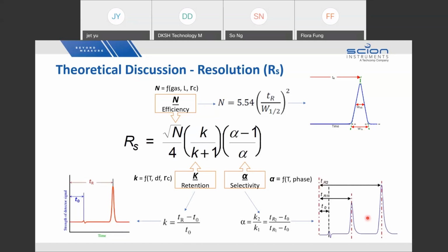the peaks. If these two peaks have very close or similar chemical properties, then there are difficulties in separation. Then we have to modify how to separate these two close-property components. Very simple examples are isomers. Isomers have the same molecular weight and similar structures, so it would be difficult in terms of separation.